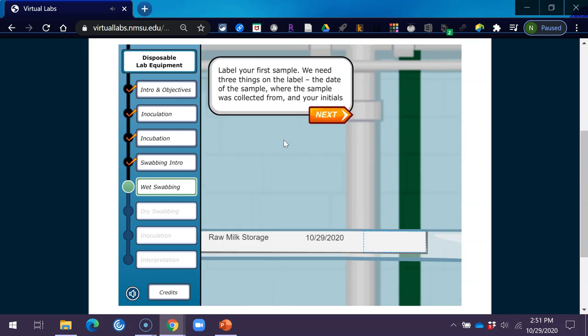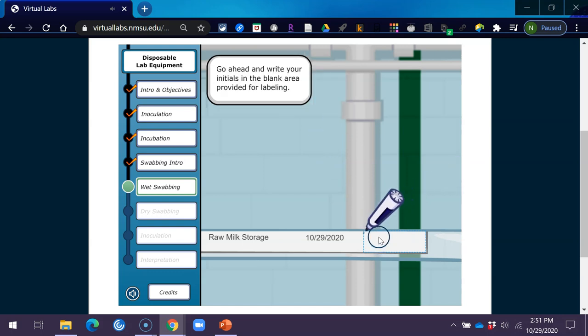Now that you have obtained a sample, place the swab back into the case. Close it tightly and swirl it to suspend the bacteria throughout the solution. Label your first sample with the date of the sample, where the sample was collected from, and your initials. Go ahead and write your initials in the blank area provided for labeling.